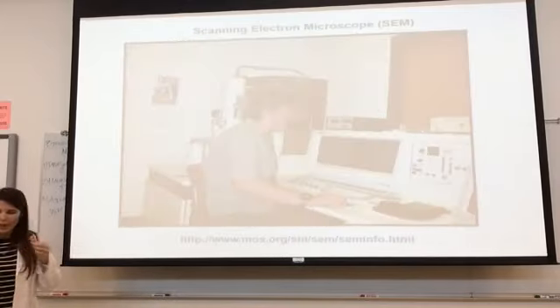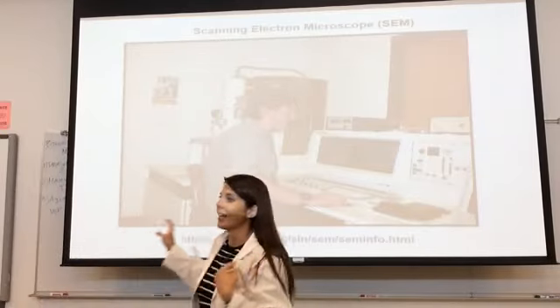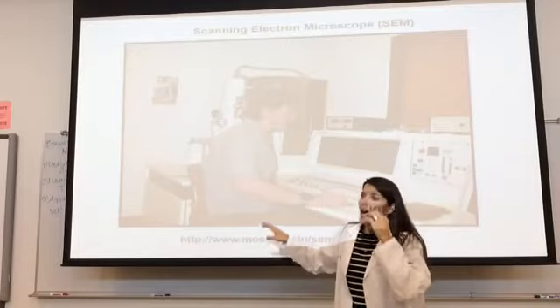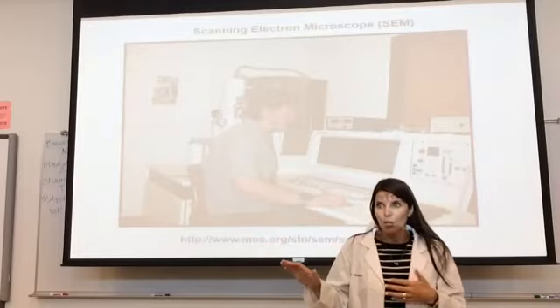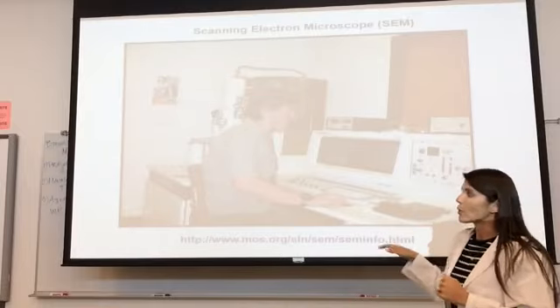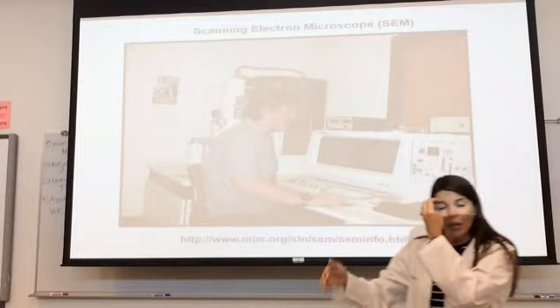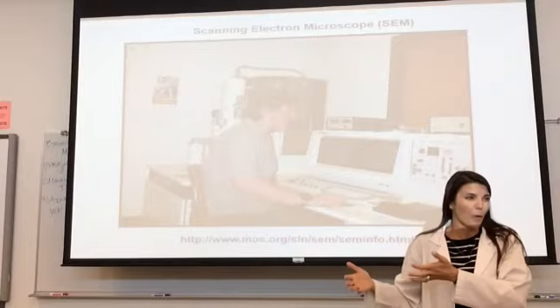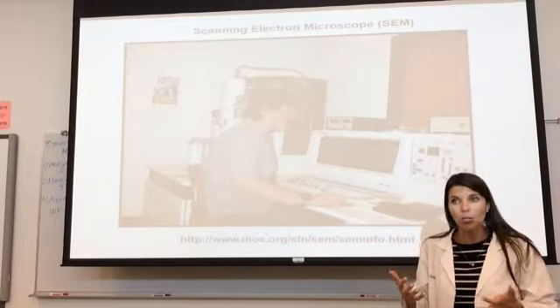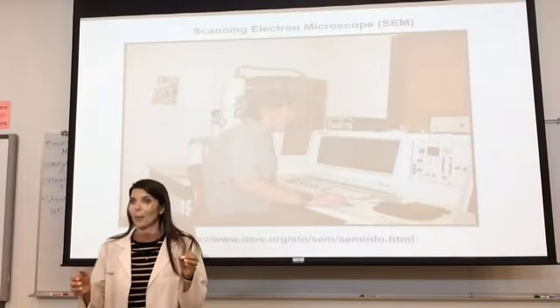The final type of microscope you need to be familiar with is a scanning electron microscope. Again, we don't have one on this campus. These are usually microscopes we find on research campuses. The setup is usually about the size of this table. Usually you have to write a grant for them because they're close to $1 million. But what they can do is incredible.